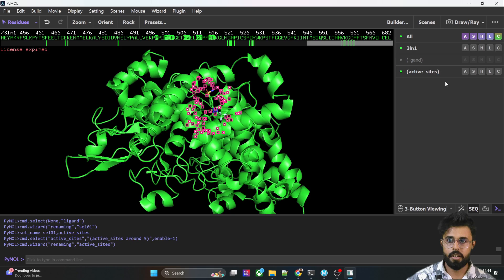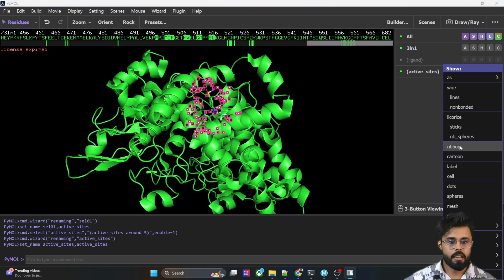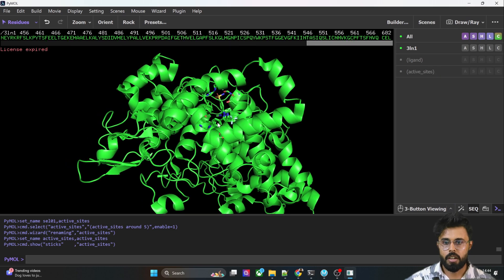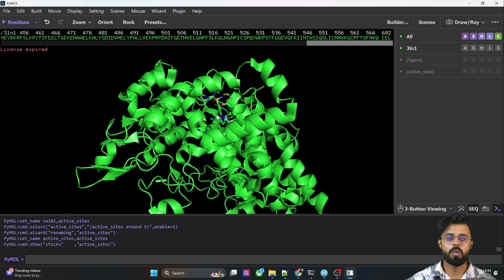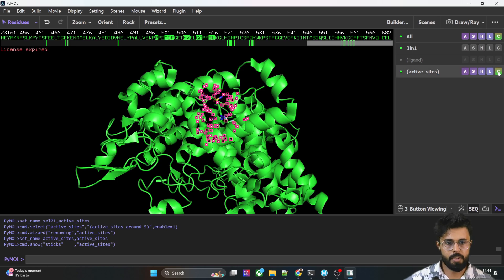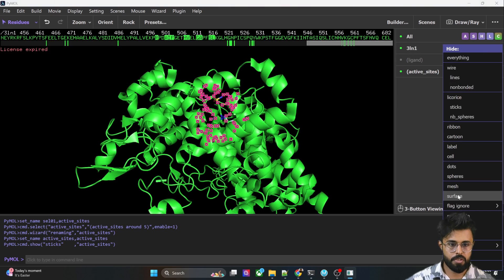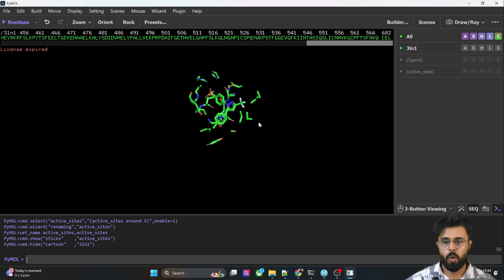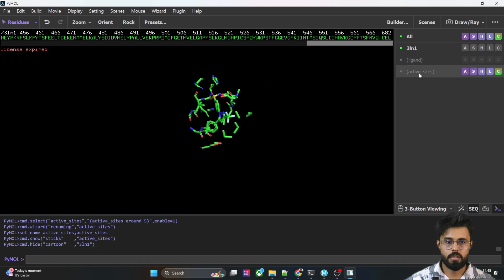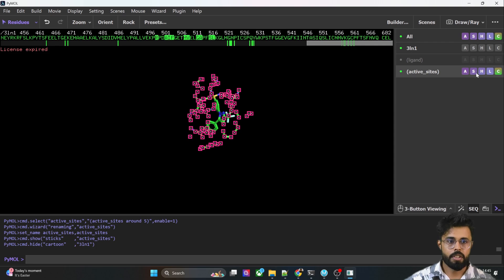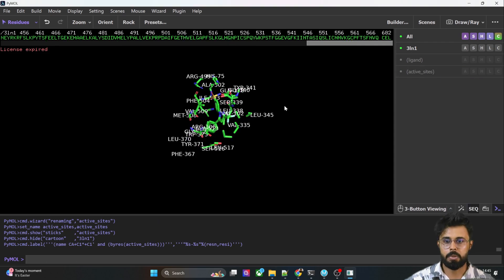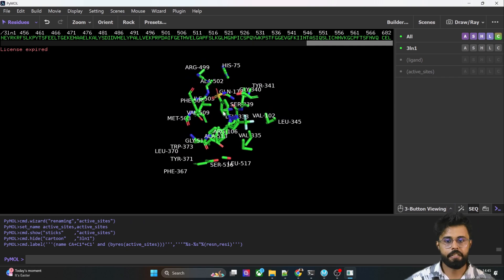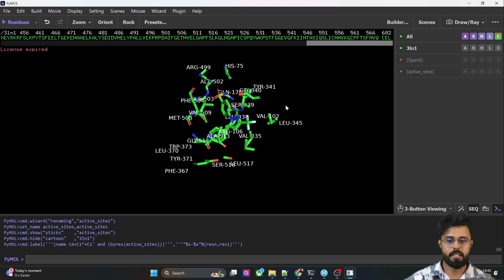We can show these residues in stick format — you can see they are already shown as sticks. To visualize only the active site residues, click on the entire protein structure and hide the cartoon. Now you can see only the active site residues. To identify them, go to the Label option and select 'Residue' — the active site residues are now labeled.